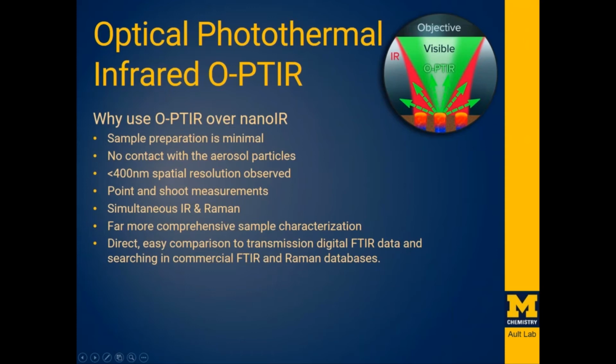We were able to look at atmospheric particles that were actually quite small because when we pulled them into our device for collecting, which is called an inertial impactor, the particle will hit and spread. So even if I had something that was maybe 200 nanometers wide up in the atmosphere, when it hits and spreads, it's probably going to have a projected area diameter of 700 or 800 nanometers. And there we're able to see it with the optical photothermal IR. And that's letting us get closer to these really important sizes for the atmosphere.